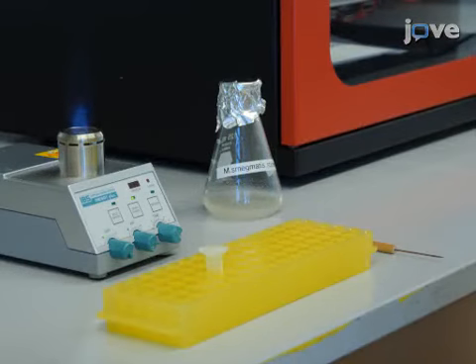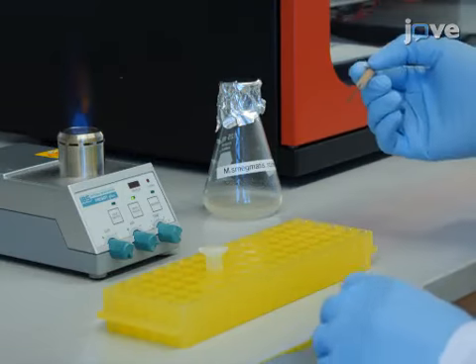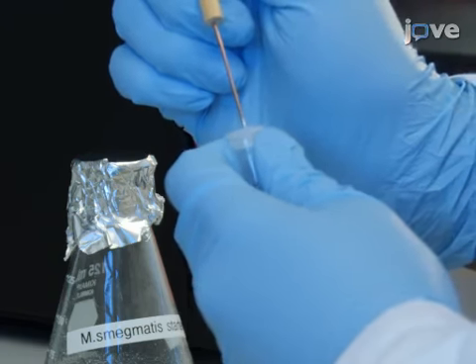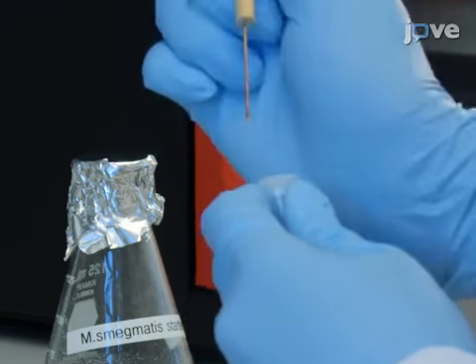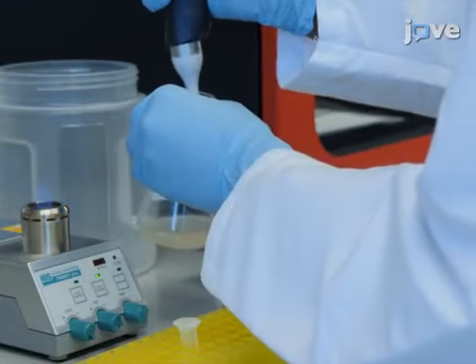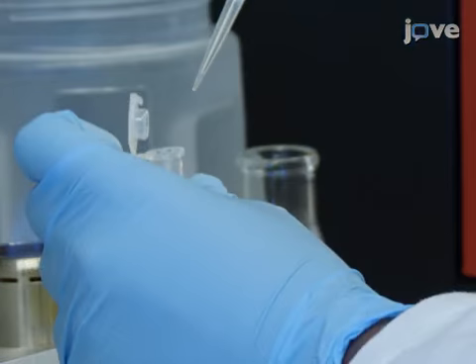To begin, with an 18-gauge needle, place a single hole in the center of the cap of a sterile 1.5-milliliter microcentrifuge tube to allow proper aeration. Then, with 5 microliters of Mycobacterium smegmatis from an overnight starter culture, inoculate 500 microliters of supplemented sterile 7H9 broth.